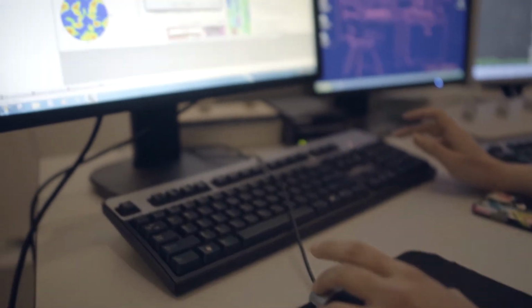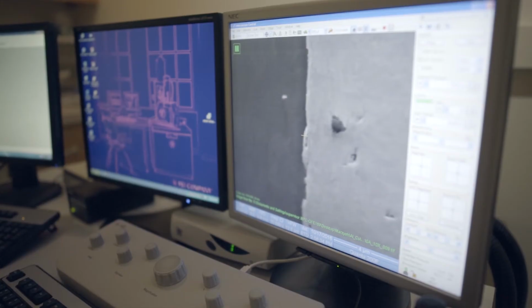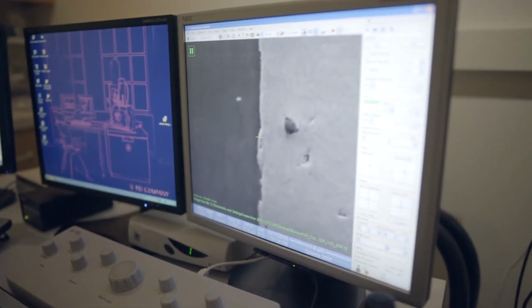And then finally, my postdoc, Marzia Moradi, is utilizing electron backscatter diffraction as well as energy dispersive spectroscopy and fractography to look at the bond strength mechanisms induced by electrically assisted roll bonding of laminates. So these are metal sheets that are pressed together under electrical current, and the current has interesting effects on the interface microstructure. And so we're utilizing microscopy to see what the interface looks like and how defects play an important role in enhancing the bond strength.